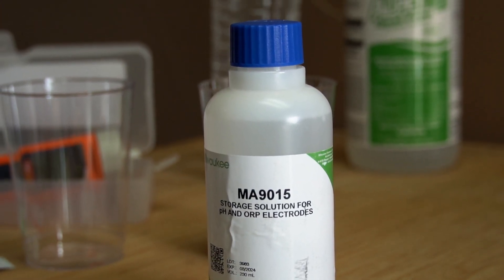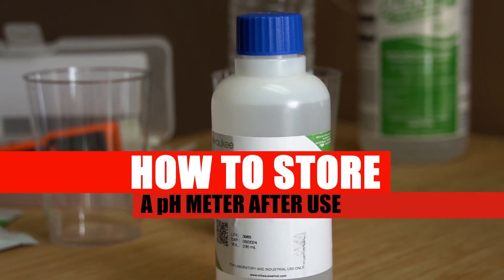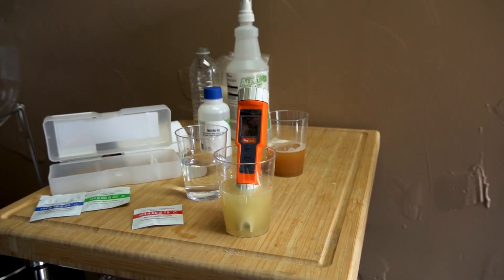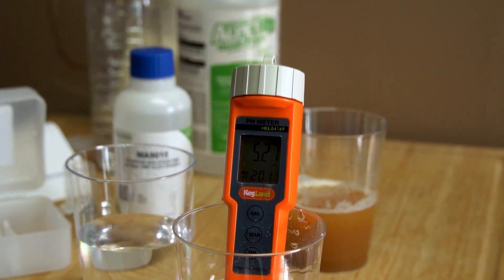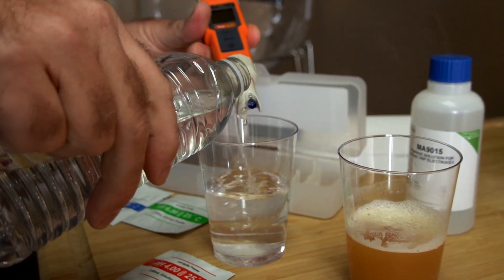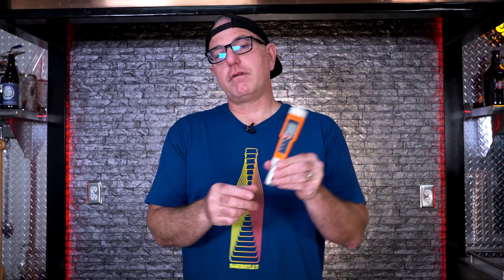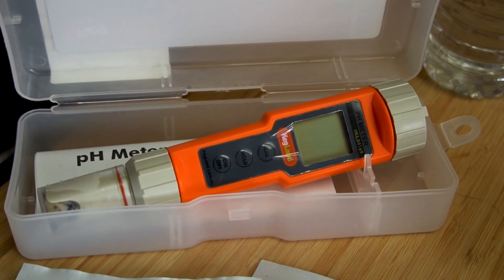Now we're going to talk about how to take care of your pH meter. Along with calibrating your pH meter, you want to make sure that you're storing it in a correct storage solution. So once you're done taking your measurement, make sure you rinse your probe off and then put it in storage solution. It's good to add a little bit of storage solution in the cap because keeping it dry will lead to it prematurely failing. There's a little sponge in there — put it away so it's ready for next time.